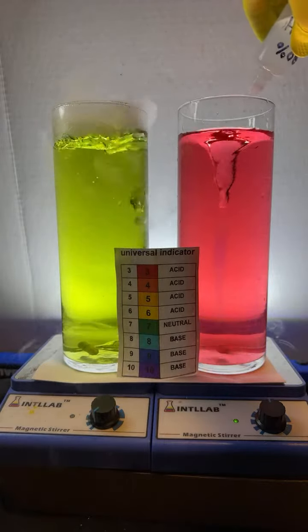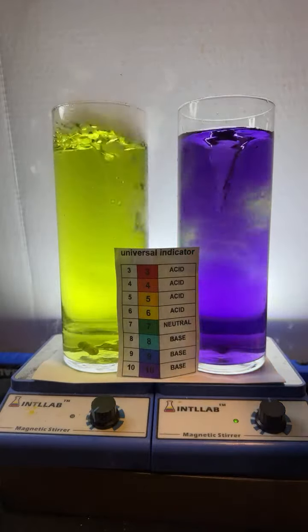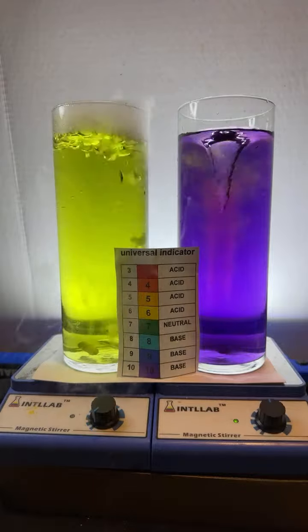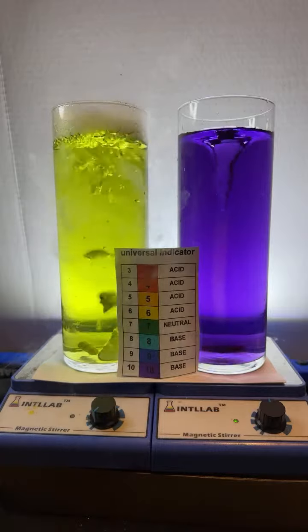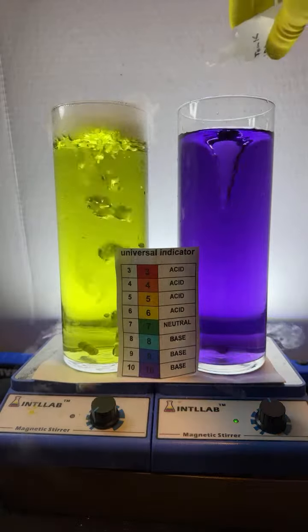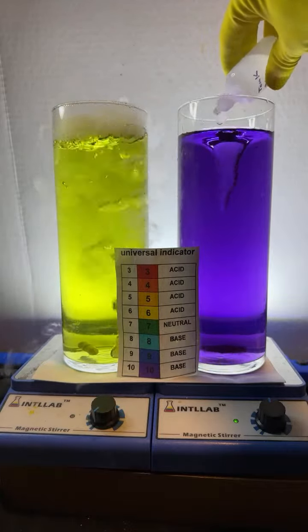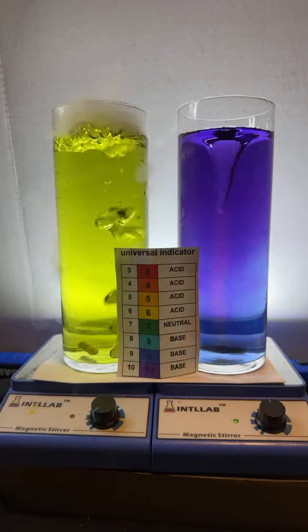What I'm guessing would happen if we mix the indicator with a super acid, I imagine that the indicator's dyes would decompose in a super acid, and we might actually see things go to like a yellow or maybe colorless. If you add acid to first flask, will it become acidic or become neutral again? Is this the first flask, or are you calling this one the first flask? I'm trying to make blue for you there.